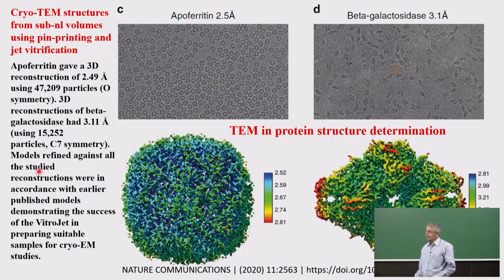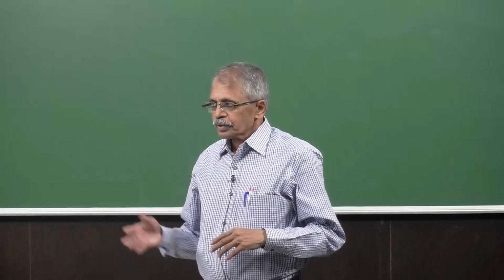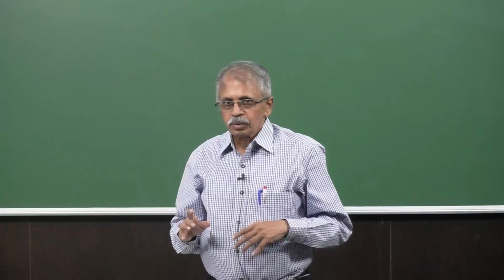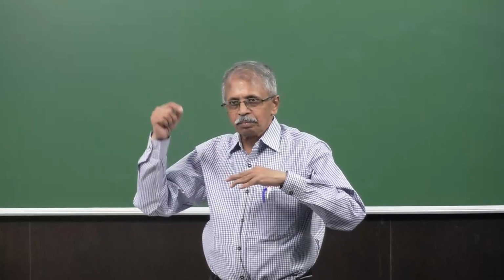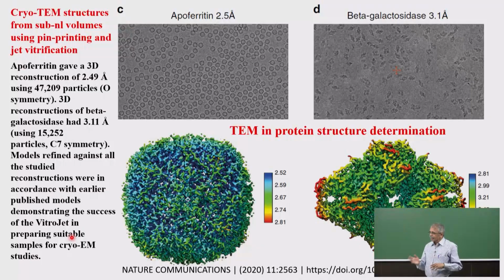So this particular paper, they call it a vitrojet, vitrification. So you ultra thin it and then freeze it. So instead of drying that way, freeze drying. It's called freeze drying, not the normal drying. So you make a very thin coating of that solution with a micro-tipped thing, and you don't do it by hand. All these are done by an electromechanical kind of connectivity, or sometimes we use some laser kind of things to move, etc., and then get the spreading of this and then study.